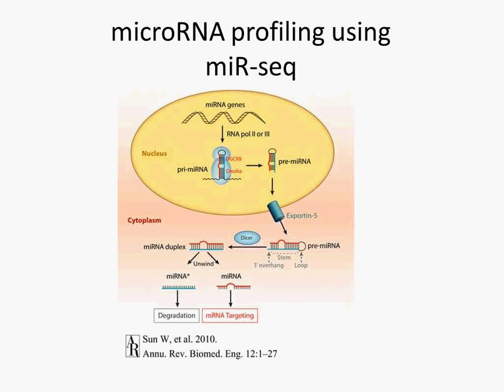So that completes the presentation of the mRNA-seq profiling. I'm going to move on to the microRNA profiling using mir sequencing.